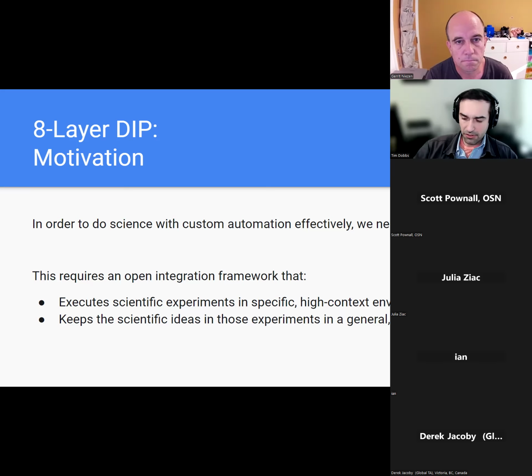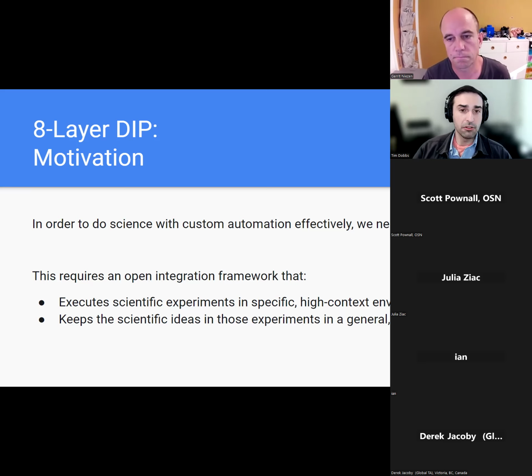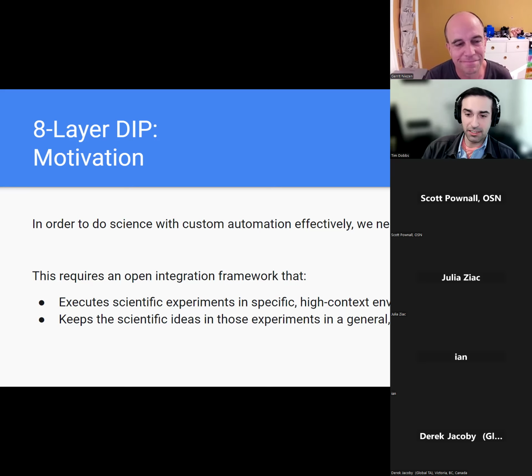And so my take on this was, well, if we want to do novel science, we almost definitely need to customize our own automation, because there are too many very specific things we want to do that are unpredictable in a usual automation workflow, especially in a university sense. If you're at NSF level, working on very early-stage science, there's just going to be customization. And in order to not accidentally spend your PhD becoming an automation engineer, although you could do worse, you should probably figure out some way to collaborate so that you can save and share resources.